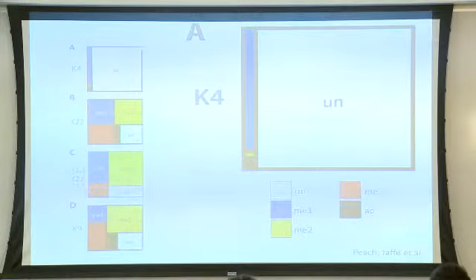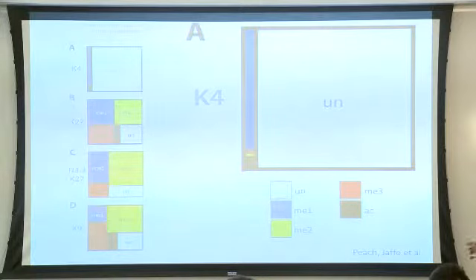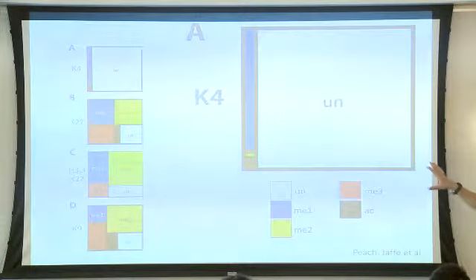I'm very interested in this figure from a paper by Jake Jaffe here at the Broad, an article by Peach et al., which looks, using proteomic methods, at the population of modified histones in a cell, and makes the point that it's possible to measure the fraction of proteins that bear any particular modification.